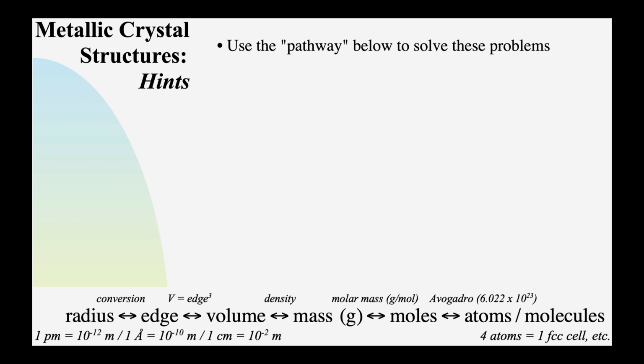You'll go from left as far as you can until you have to stop. Then you go right as far as you can until you stop. Good to go. That's really kind of what it comes down to.